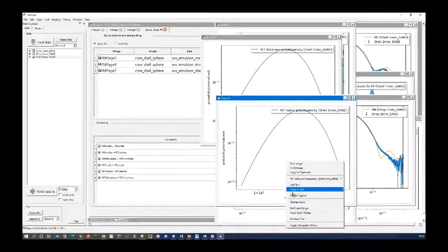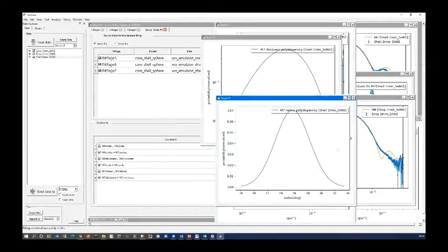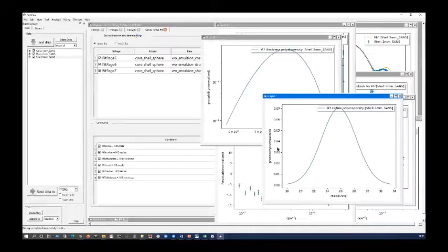Now, at the moment, this is looking a bit funny because it's on a log-log scale. So let's change this one to a linear scale. Okay, so there you go. There's our Gaussian distribution. Something to be wary of when you're using distributions is you want to be careful that your distribution doesn't extend below 0, because if it does, that's going to give you some weird results.